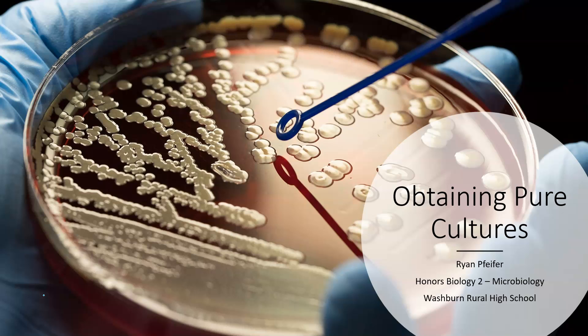From a microscopic standpoint or a microbiology standpoint, it's all about isolating pure cultures that are genetically identical so that you can ensure that all microbes within the experiment or within the sample that you're collecting are the same.